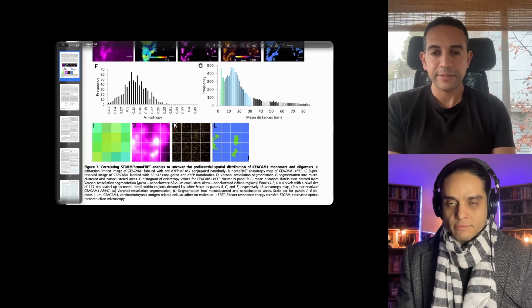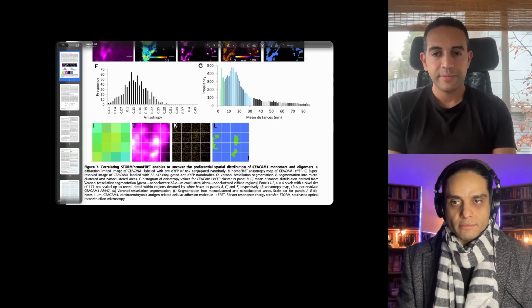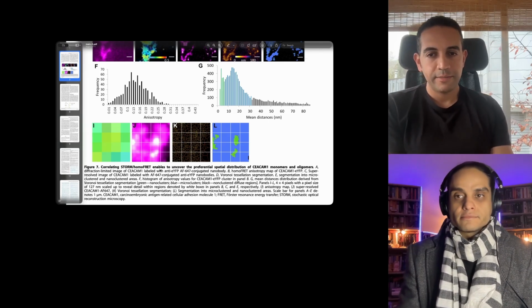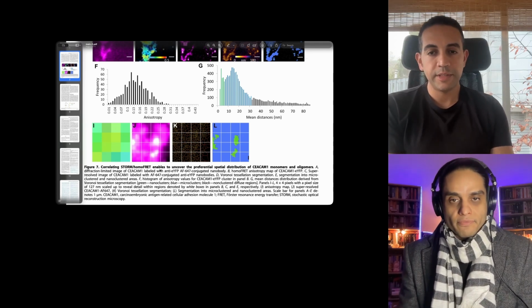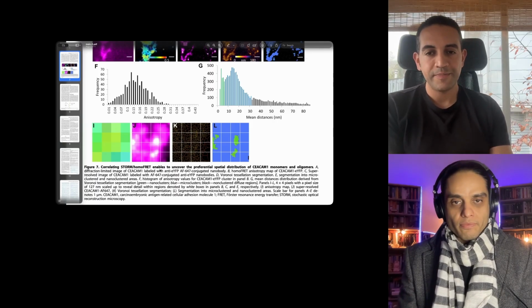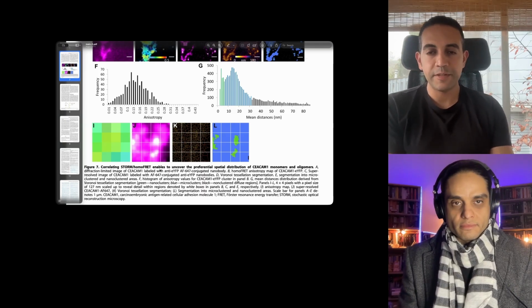By sheer physics, I think the vast majority will think that due to their proximity, they must be forming a functional oligomer. Yeah. And because you're squeezing them together. Exactly. The reality of it is they're close together, but they are not within that 1 to 10 nanometer distance. That would not necessarily confirm that they have self-associated.